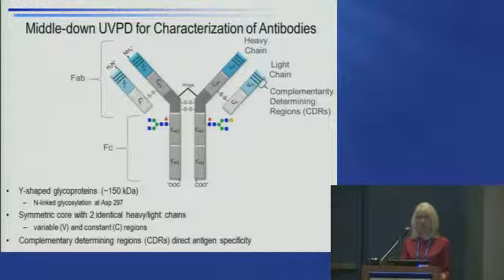fact of the matter is we don't have sufficient resolution with the mass spectrometer to sort out the very complex fragmentation patterns. Just too many overlapping charge states of fragment ions, too many overlapping isotopic distributions of fragment ions, so it's really quite a mess if we go to proteins that are 150,000 daltons. So that means a middle-down approach looks very attractive.